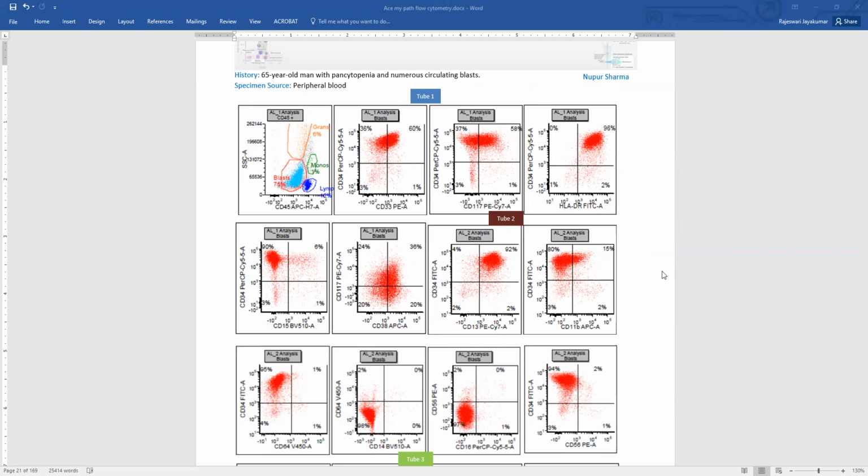So we can say acute myeloid leukemia, and you give the percentage of blasts. It is always necessary to write in your description what the blasts express and what the intensity of expression is, because some of these are used as targets for therapy. For example, CD33 has antibodies that can be used for treatment. And some places also have clinical trials where the trials require the percentage of blasts that express these individual markers, to see if the patient is eligible to be enrolled in that trial.